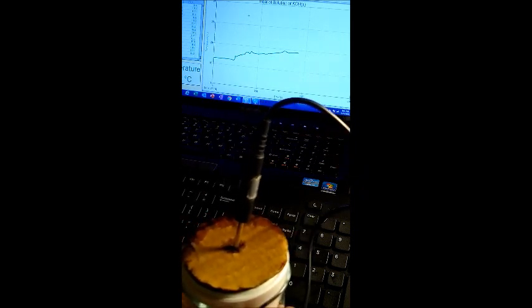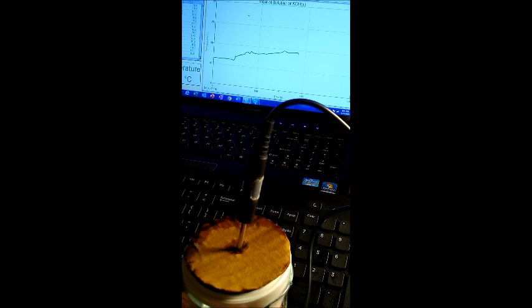I'm assuming it's all dissolved in there. The point is to 100% completely dissolve the 3.0 grams that I used. And see, the temperature's starting to drop, so I'm going to stop here. And let's see how we would process this data. So what we would do is, here's our initial temperature. Let's assume that this is our final temperature somewhere in here.